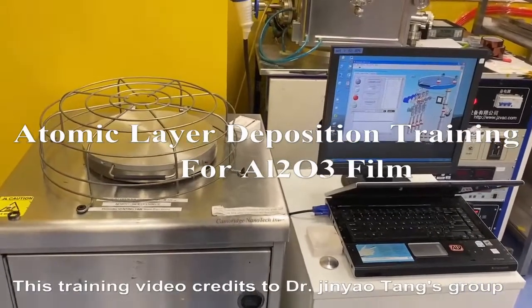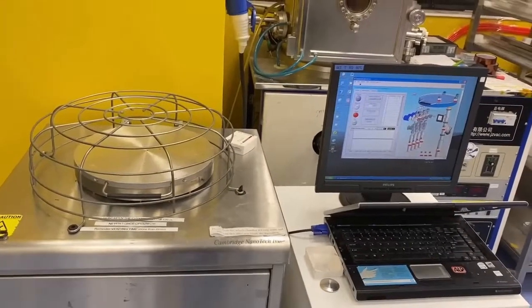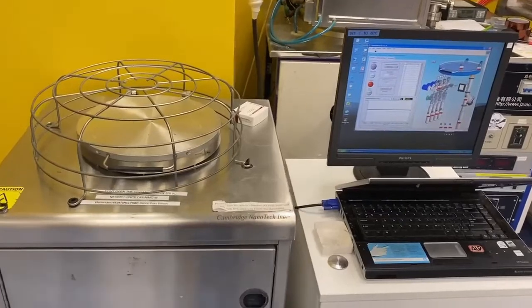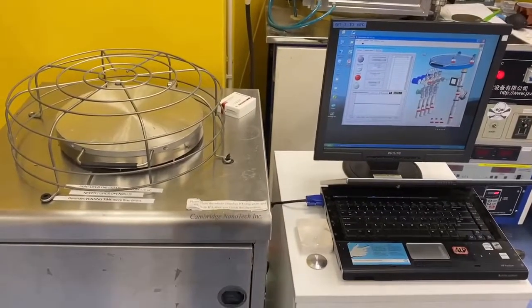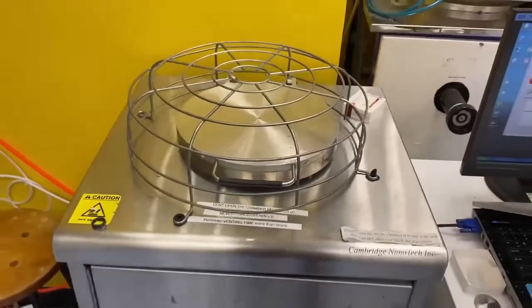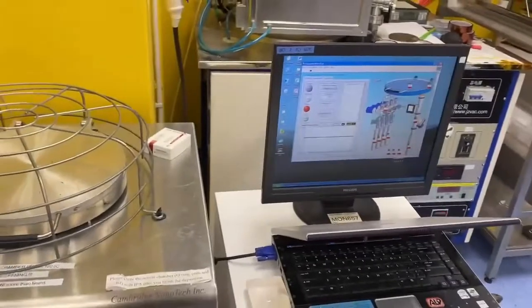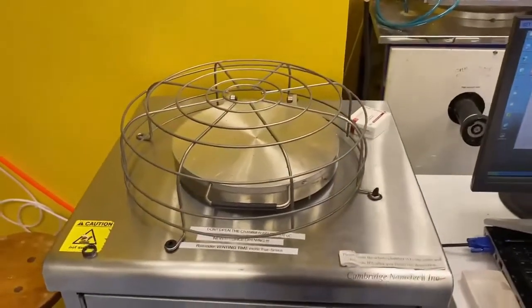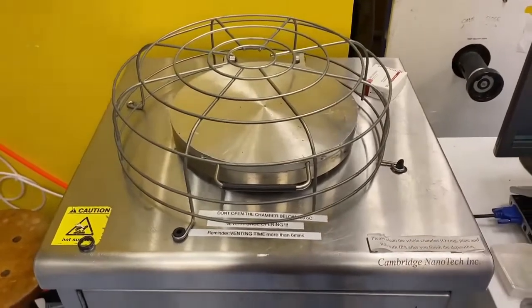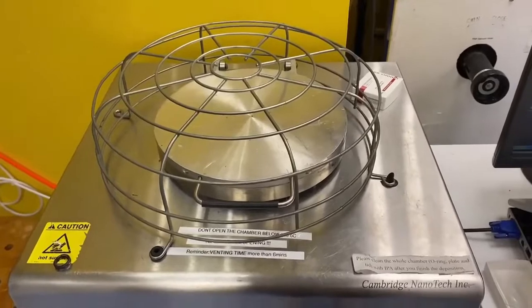Today, I will give a brief introduction of the working process of atomic layer deposition techniques, and also demonstrate how to deposit aluminum oxide films on silicon wafer. Now, firstly, I want to introduce every part of the machine and show how to use programming instructions by LabVIEW. Now, here's a chamber where the precursors are sequentially introduced in and build the atomic layer.